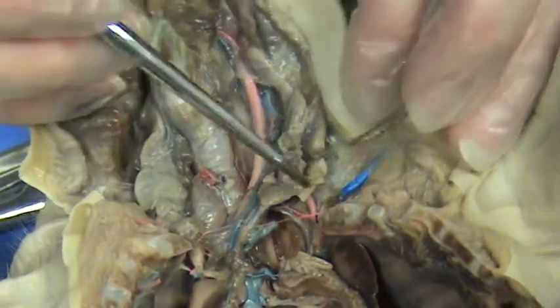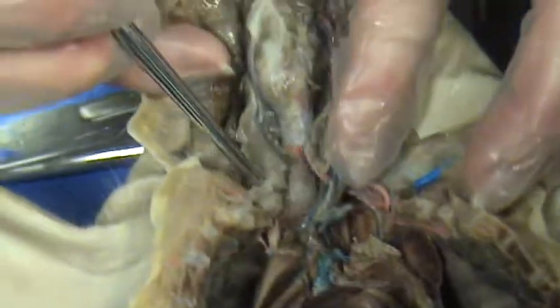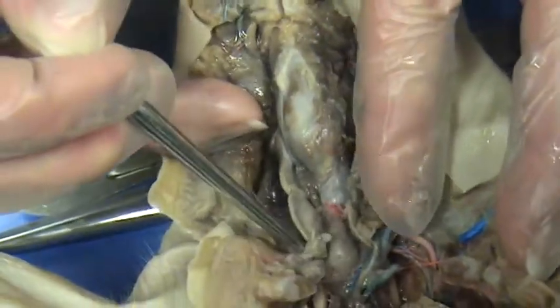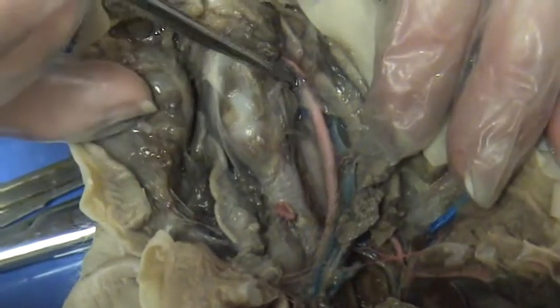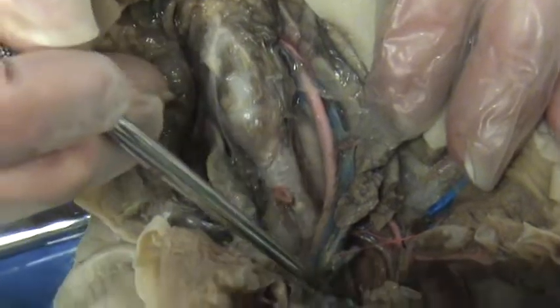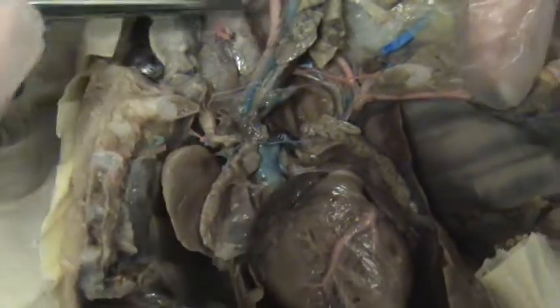Thyroid gland sitting on top of the trachea. And this thing right here. Thymus gland sits around the thyroid like so. Okay, so thymus, thyroid, thymus. Carotid artery, taking blood up to the head. Jugular vein, draining it down from the head. Jugular vein's blue? Jugular vein is blue. Yeah, veins are always going to be blue. Arteries are always going to be pink. Cool.